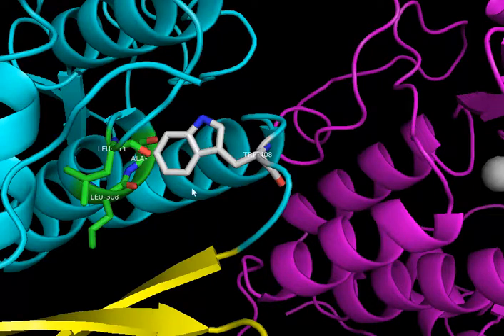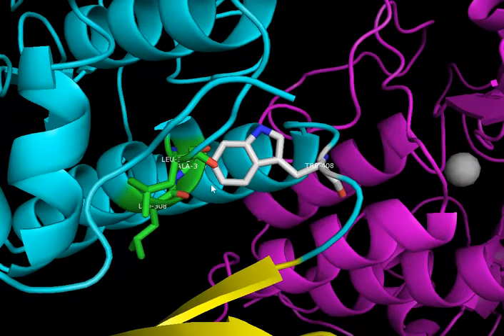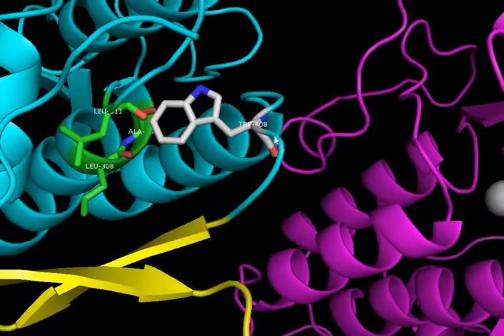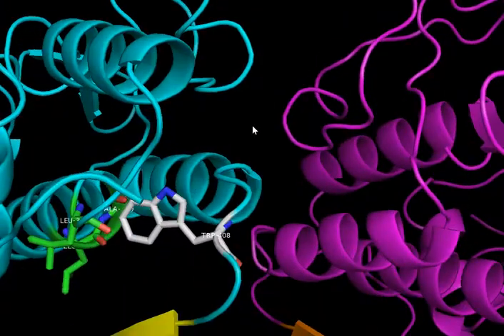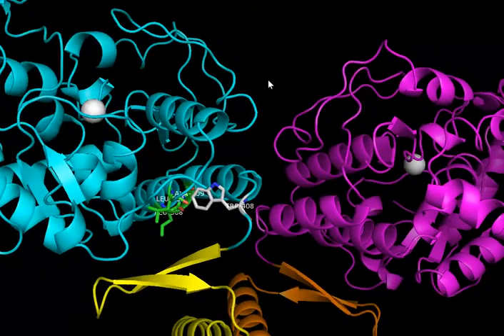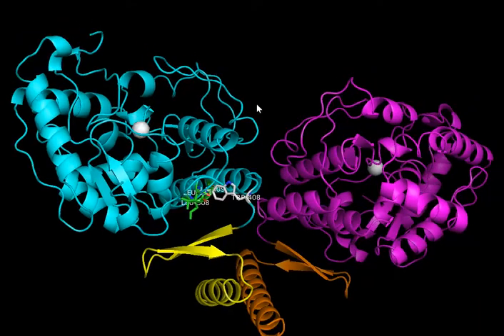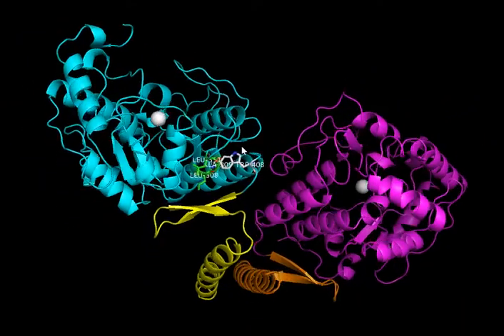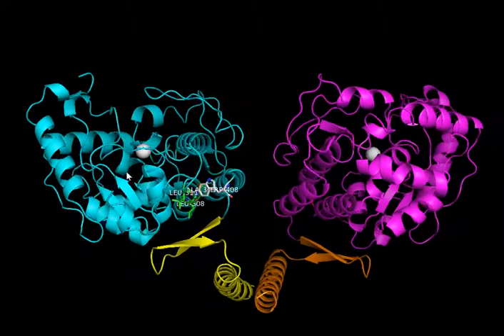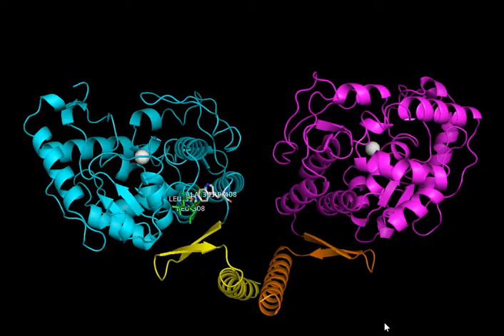Importantly, you can now see loss of those hydrogen bonds, shown before. This means that the oligomerization domain loses its specific orientation conferred by those bonds. And this has been shown to result in protein aggregation and complete loss of the tetrameric form of the enzyme. Effectively, these protein aggregates are non-functional, and therefore you get increased levels of phenylalanine in the blood, which leads to the symptoms of PKU.